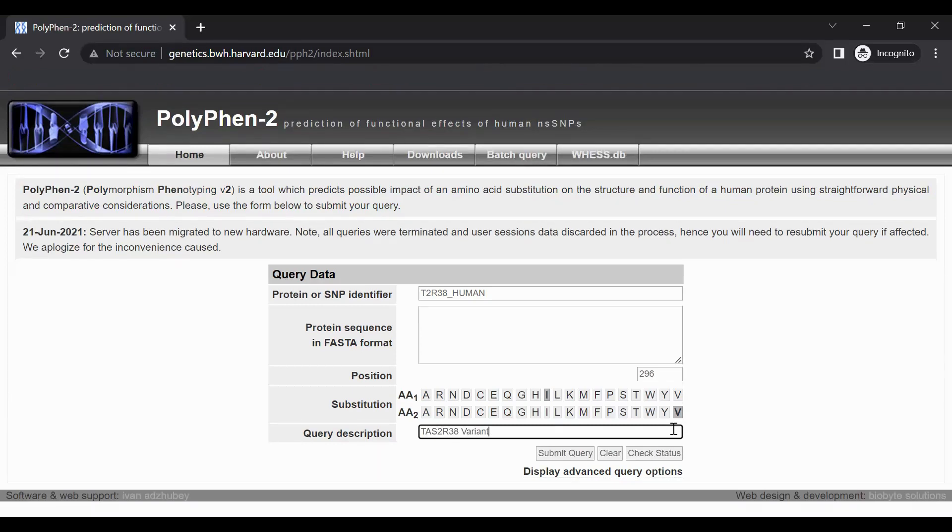Leave all other settings as they are and press the submit query button. This submits the information to PolyPhen-2 for analysis.